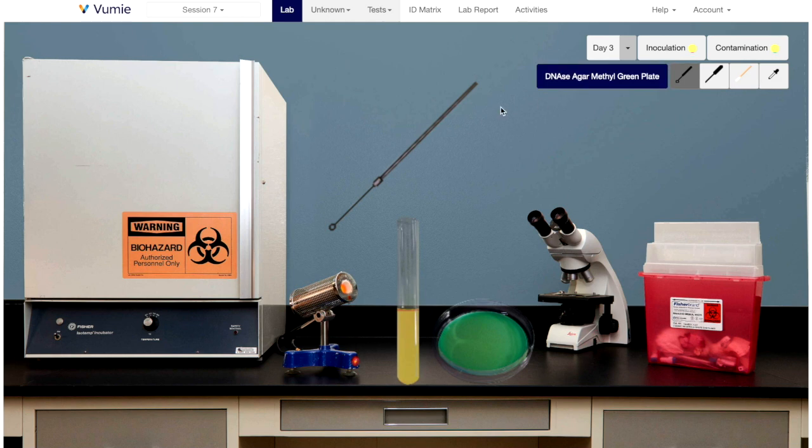Select the transfer tool and flame it. The tool used for streaking plates is an inoculating loop. Move the tip of the transfer tool down into the inoculum broth. A message will appear indicating success.